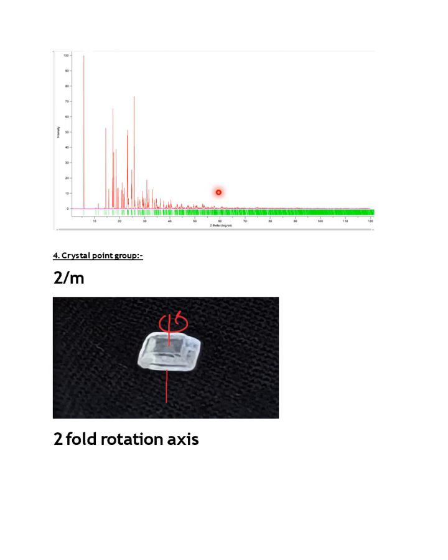By using the OLEX2 software, we generally determine the electron density, and by using the VESTA software, we calculate the structural refinement and powder XRD data. And this is the point group of the crystal structure, and I analyzed the point group.